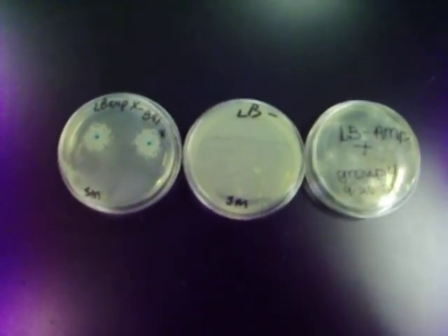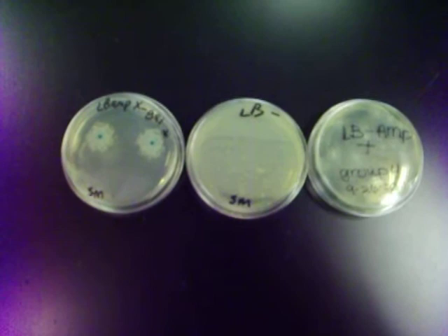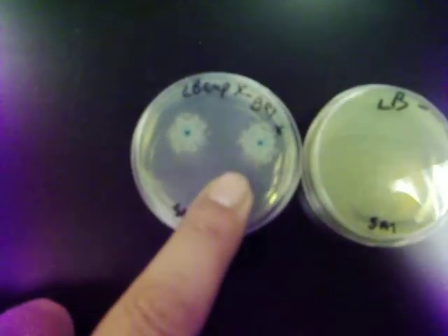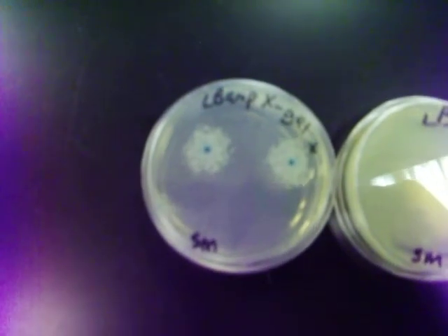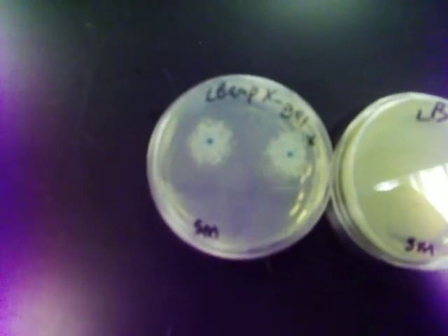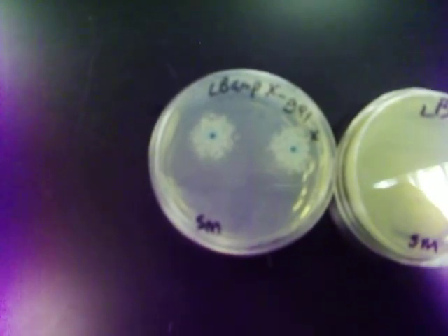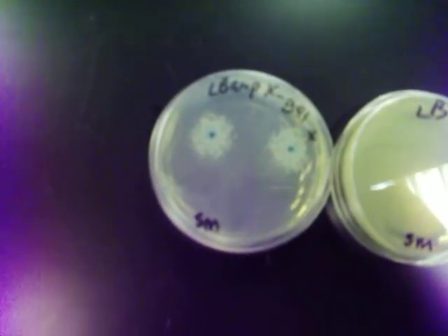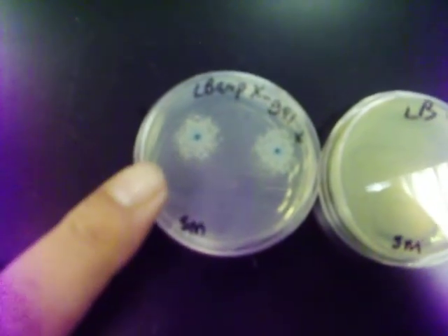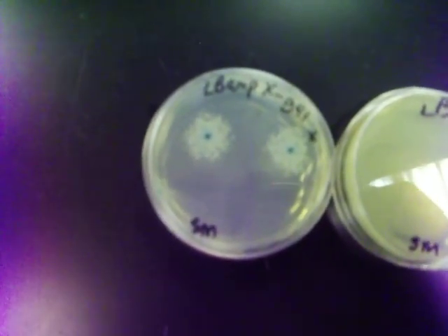And then we used the X-Gal, that gave it the blue color, as you can see here. We put pBLU plasmids into E. coli to make it competent, so that way it could become ampicillin-resistant. And the blue is a marker which shows us that it was successful.